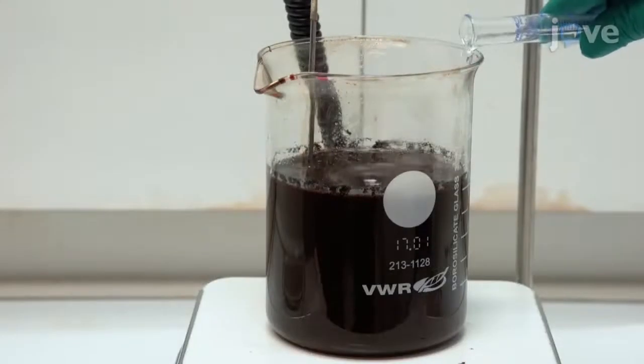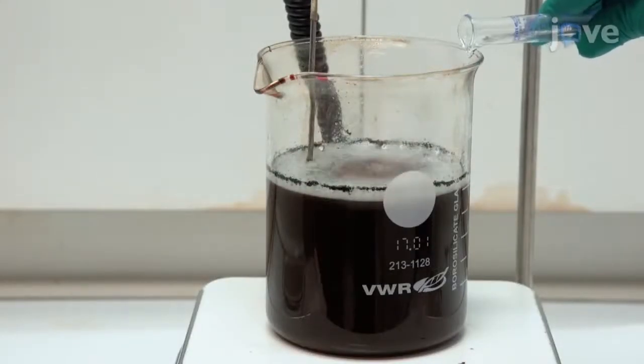Add 7.5 milliliters of 30% hydrogen peroxide to the hot dispersion.